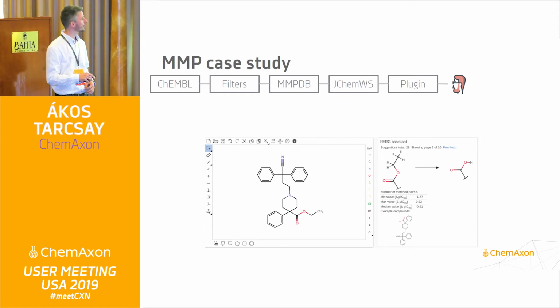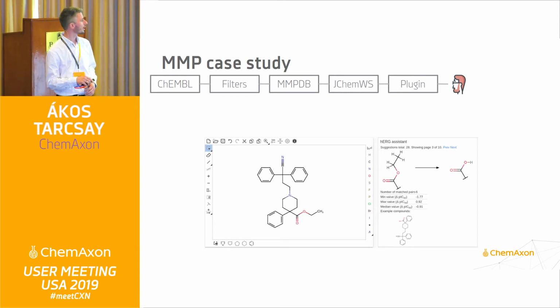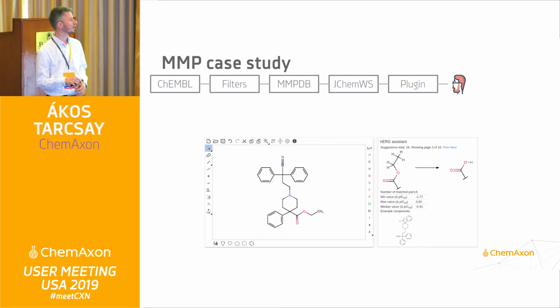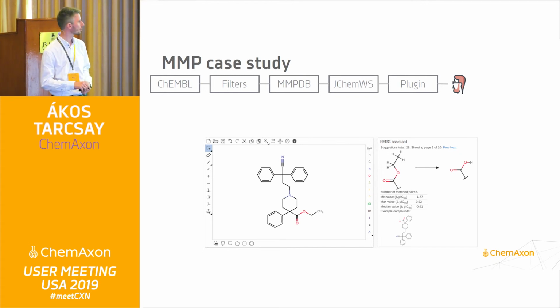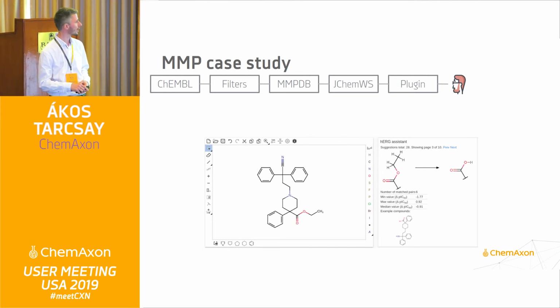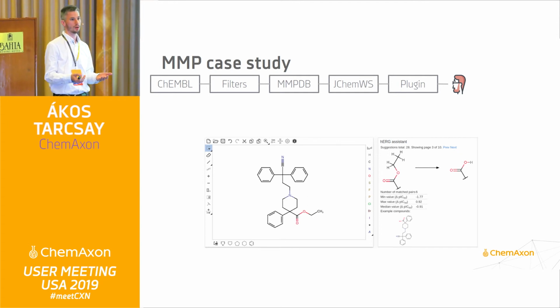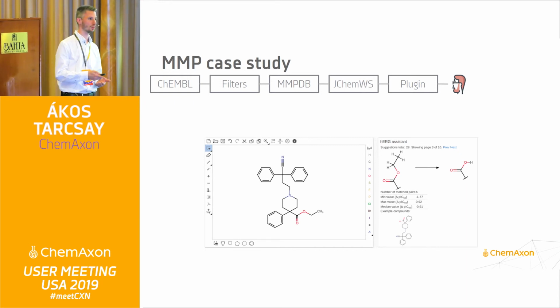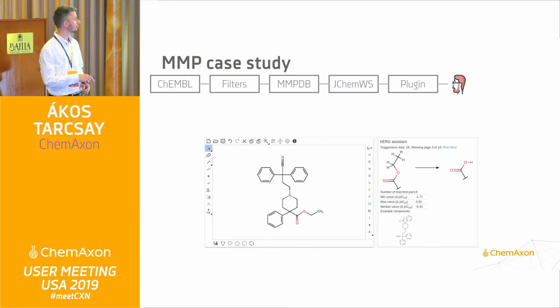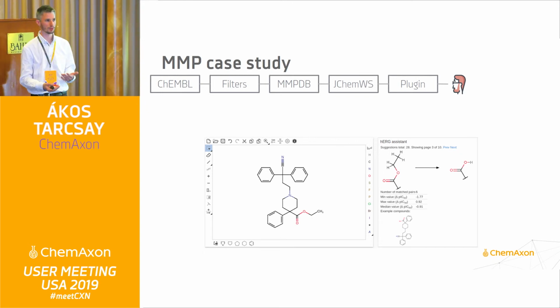It will then offer you a couple of transformations in an ordered way, with the highest positive effect first, so you will see first the one that will affect your structure the most, and even show you an example compound of what will be your best choice during the optimization of that parameter, which you can easily just set back to the canvas and start working with.